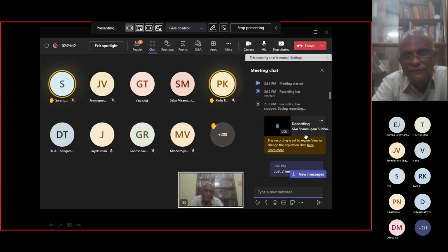Sir, in continuation with this question, I also have a doubt. What I understand from your answer is, when I submit the TLC reports in my research, they say HPLC has better, precise, accurate results, and they ask me to give HPLC results, and they don't agree with TLC. So from your answer, it's a way of how we explain and establish with whatever papers we have in our hand.